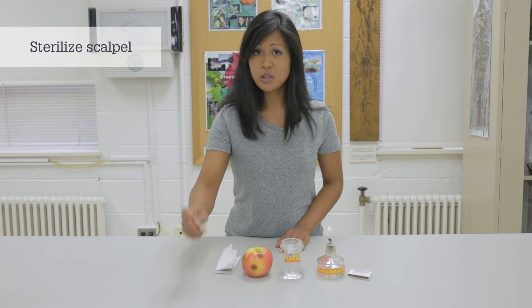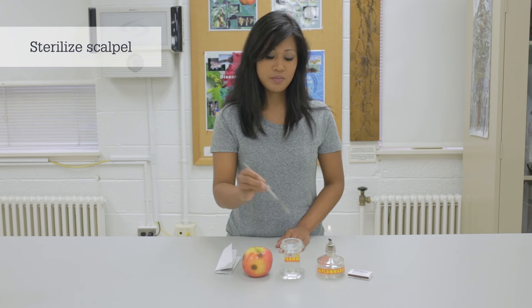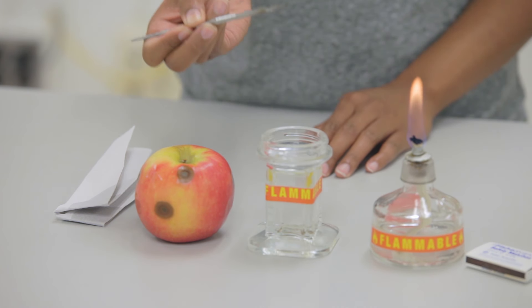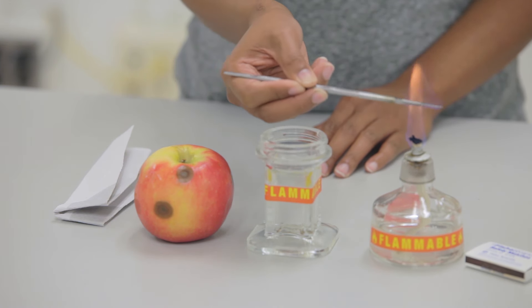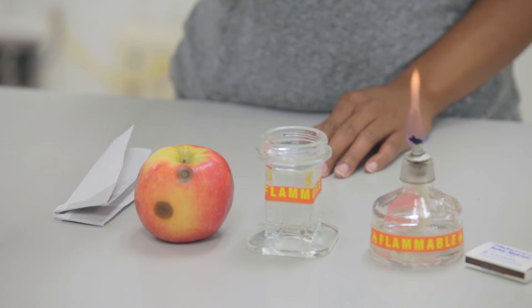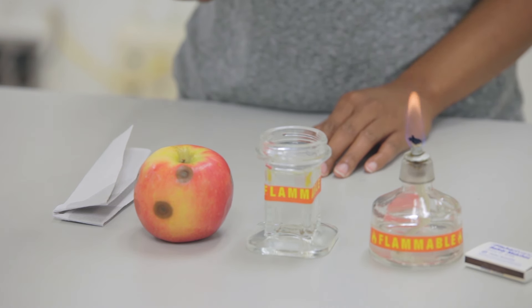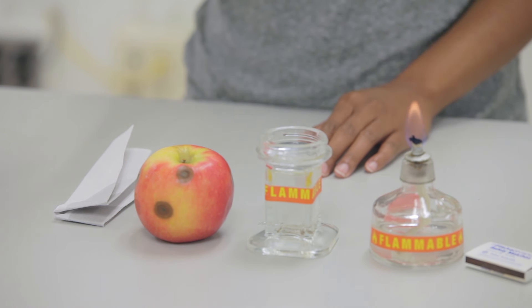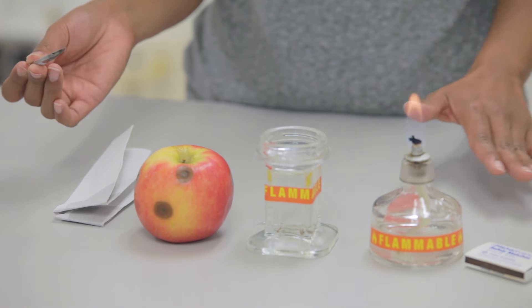Next, we're going to sterilize the scalpel that we're going to use to cut out diseased tissue. Dip it into the 95% alcohol, let the excess drip off, then hold it over the flame. The rapid burning of the alcohol helps to kill microorganisms that may be on the surface of the scalpel. It's important to keep the scalpel, now that it's sterilized, from touching other non-sterile surfaces.